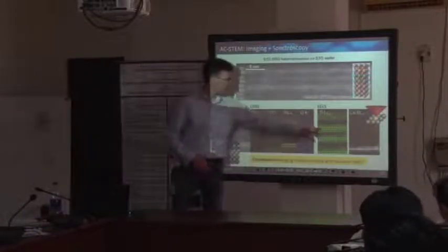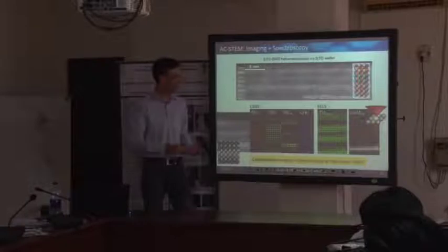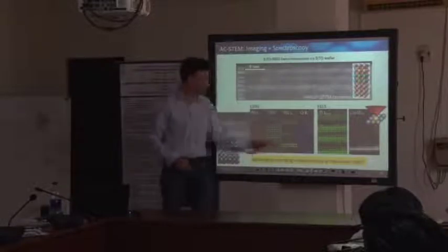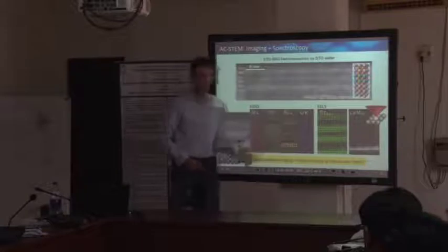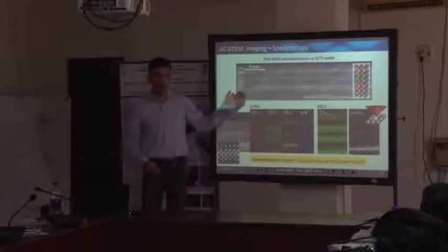This is the complementary EELS measurement. So this is the similar distribution. This is measured at a slightly larger step size, because here the exposure time was even longer than there. But in principle, you can do those measurements with a really good sample. I mean, it's all about having good samples for atomic resolution spectroscopy and imaging.